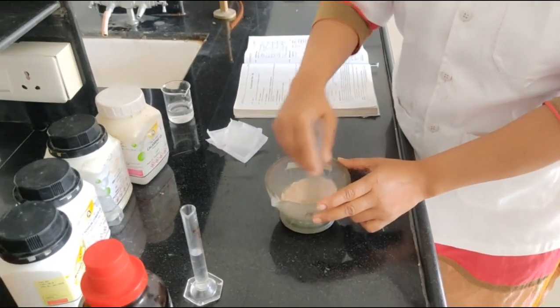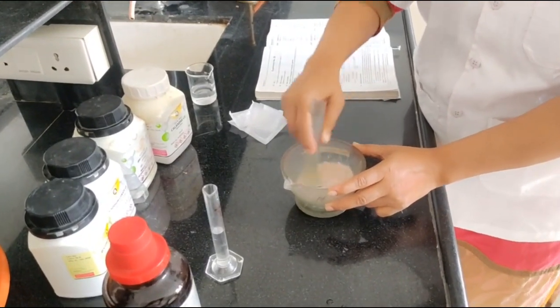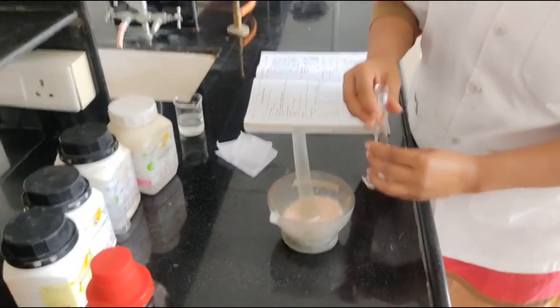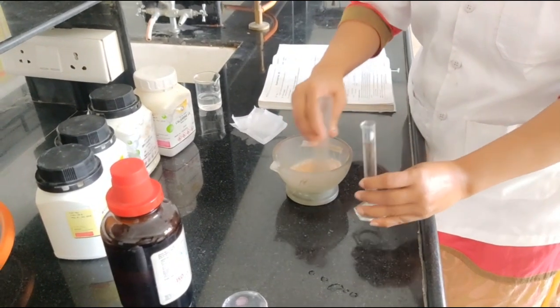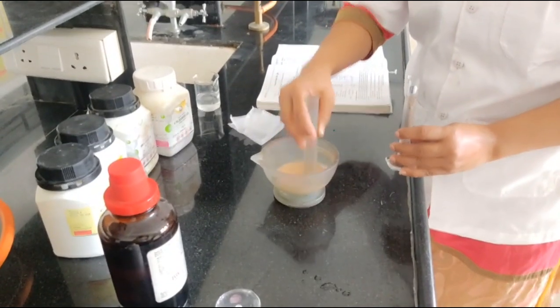Today we prepare only 10 ml of our calamine lotion. We require only 7 ml of water. We already measured the purified water, 7 ml. Add slowly into that. Triturate it. See the color of our preparation.